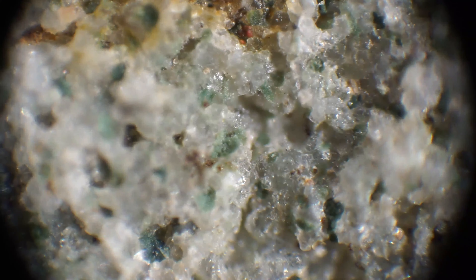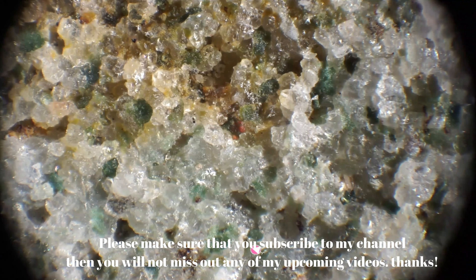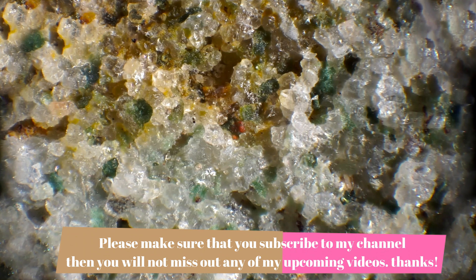The previous was 4x ocular, so now we change to 10x. Here we go with higher magnification and more details. Let's do a focus stack here also — focusing, then cutting out the frames and building up this image in Helicon Focus 7. I then edit it in GIMP a little, adding some colors, contrast, and a little sharpness.